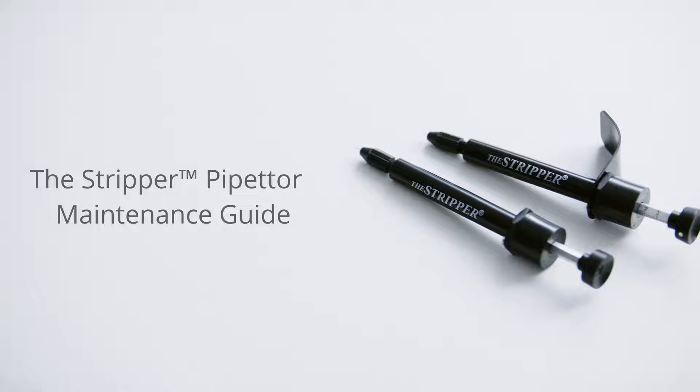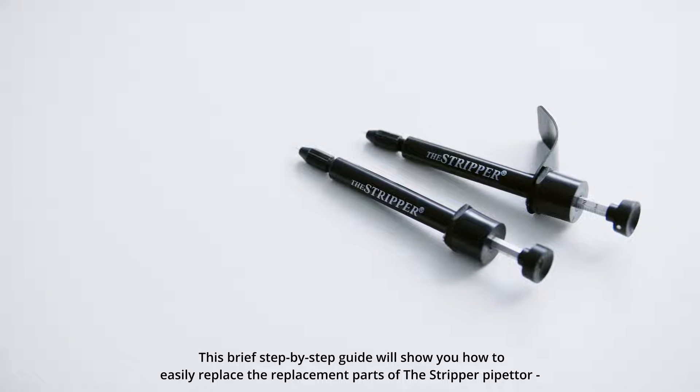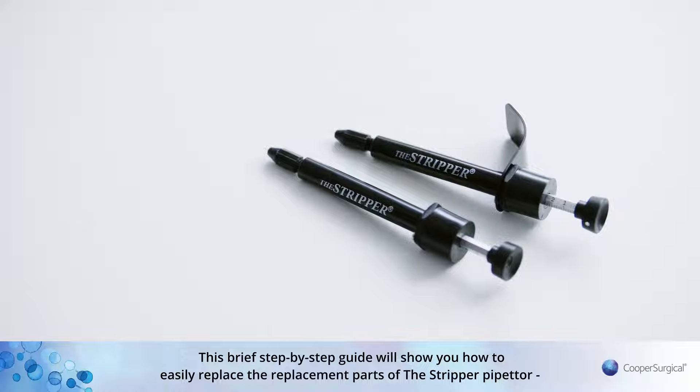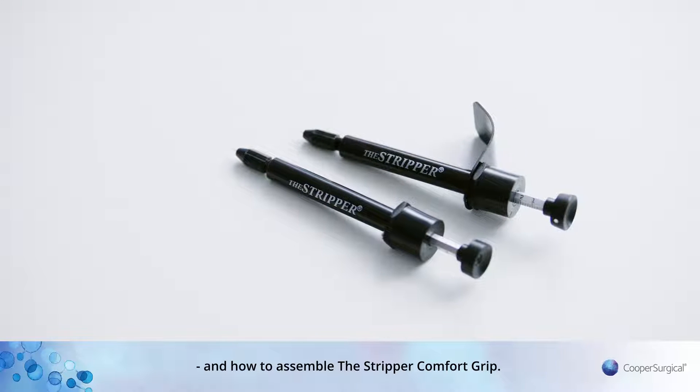Welcome to the Stripper Maintenance Video Guide. This brief step-by-step guide will show you how to easily replace the replacement parts of the Stripper Pipetta and how to assemble the Stripper Comfort Grip.